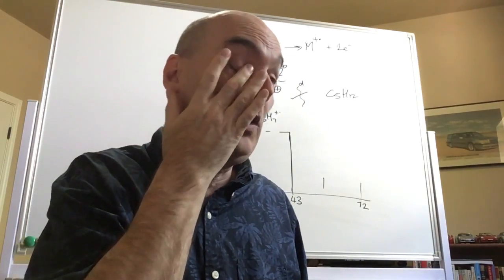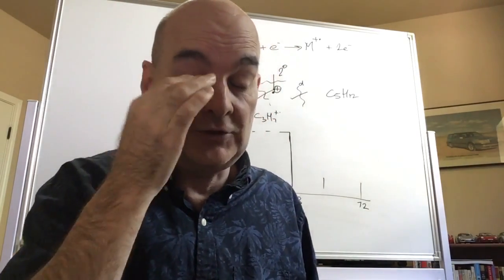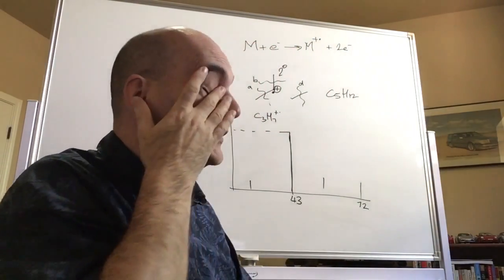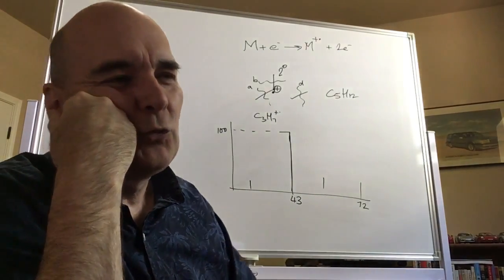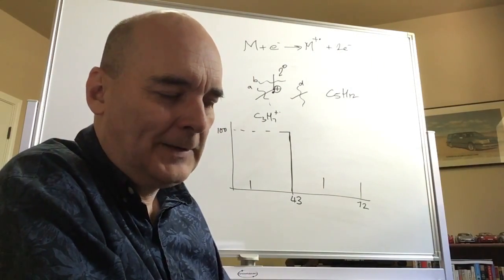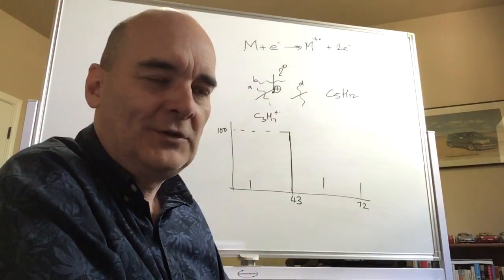if you go and you read a chapter on mass spec interpretation, you'll find at the beginning of the interpretation part of the chapter that they outline all of these rules about do these small calculations before you start. And as a matter of fact, they do that in the NMR chapter as well.